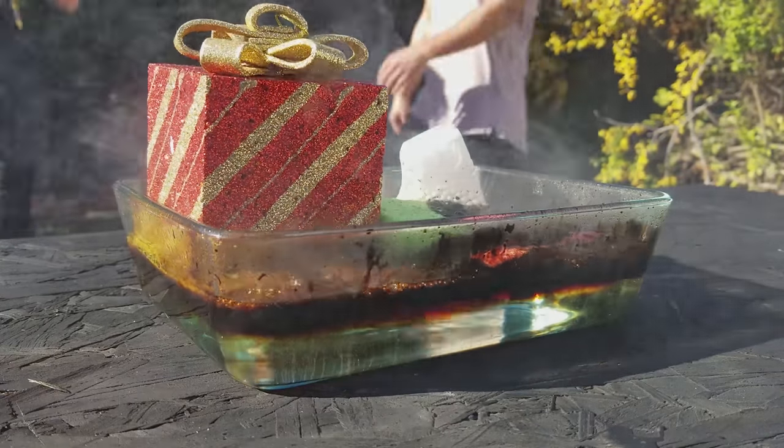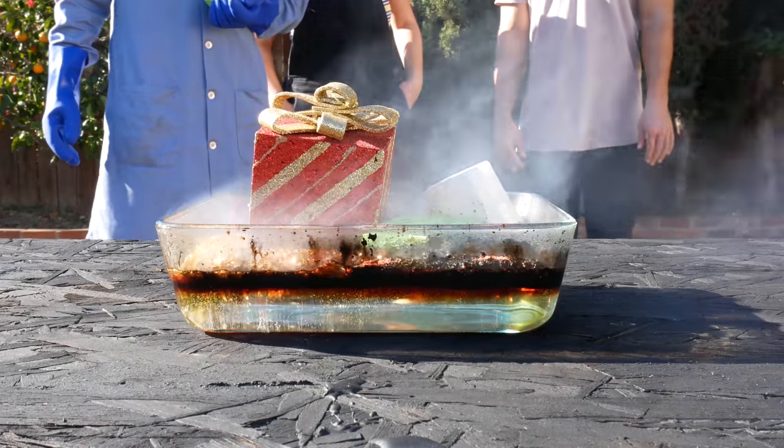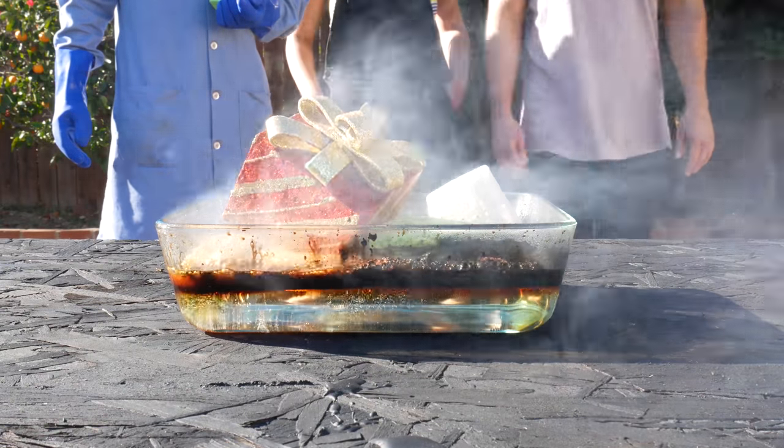Alright, so the sponge works — it reacts very, very quickly. That melted. It looks like a weird sort of black tar jacuzzi.